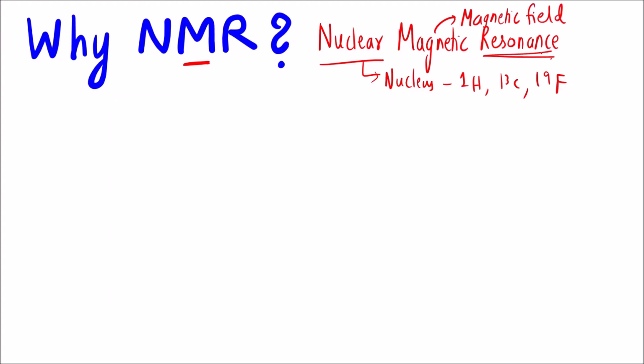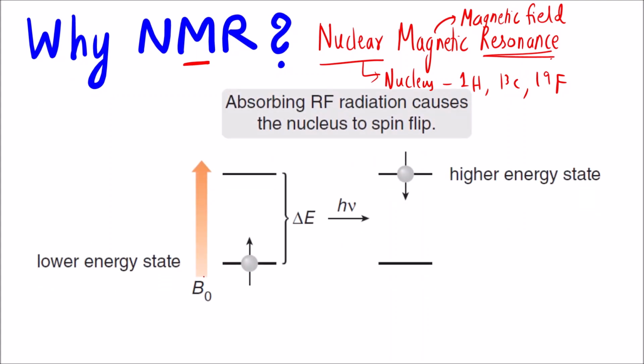And why is it called resonance? What is the meaning of resonance? Whenever we apply a radio frequency, RF, resonance basically means the matching of frequency.